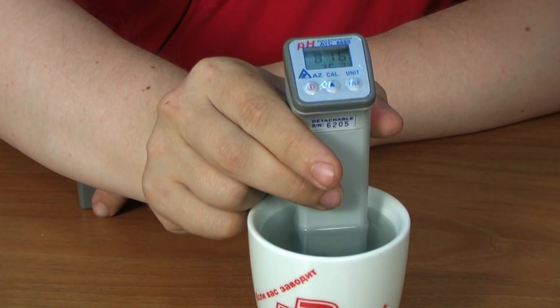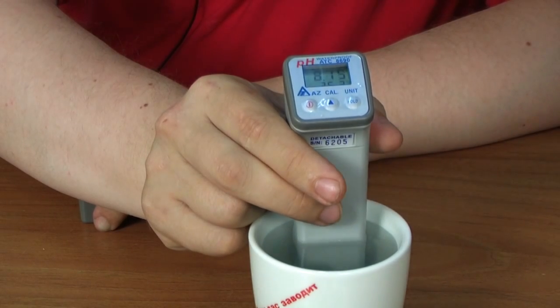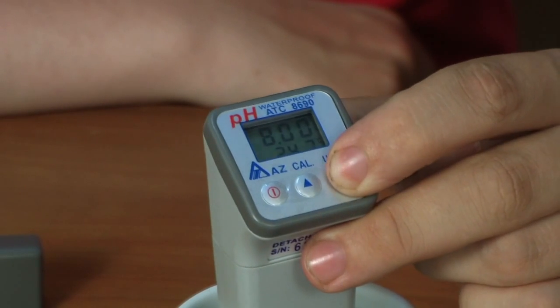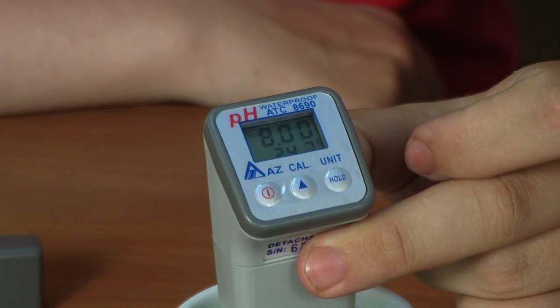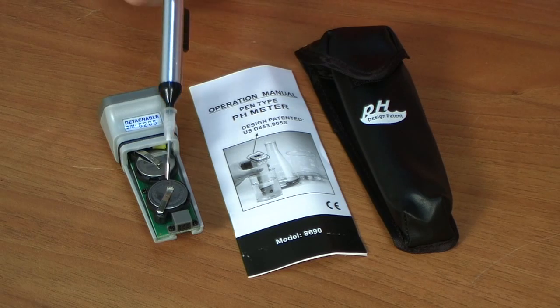When the measurement has been taken, the resulting pH value will be displayed. The temperature value will appear on the additional display. To save your measurements on the display, press Hold. The decimal point will stop blinking.